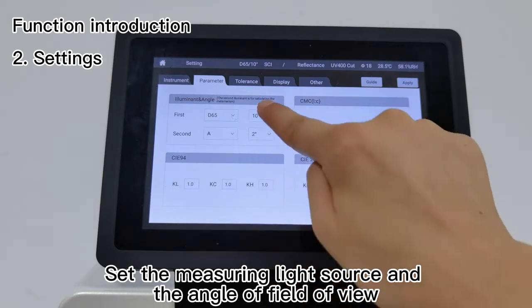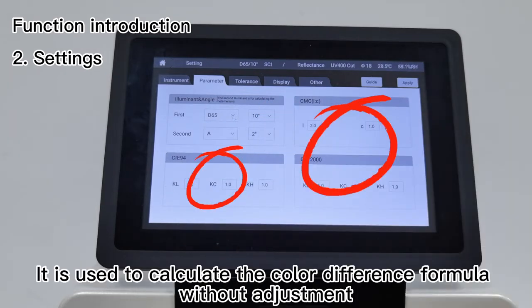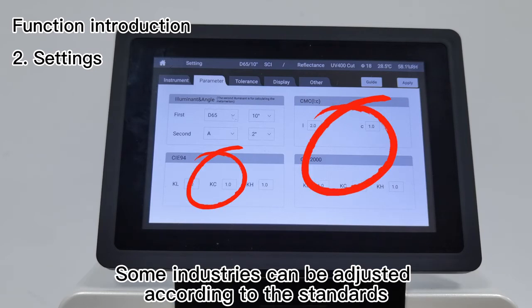This is used to calculate the color difference formula without adjustment. Some industries can be adjusted according to their standards.